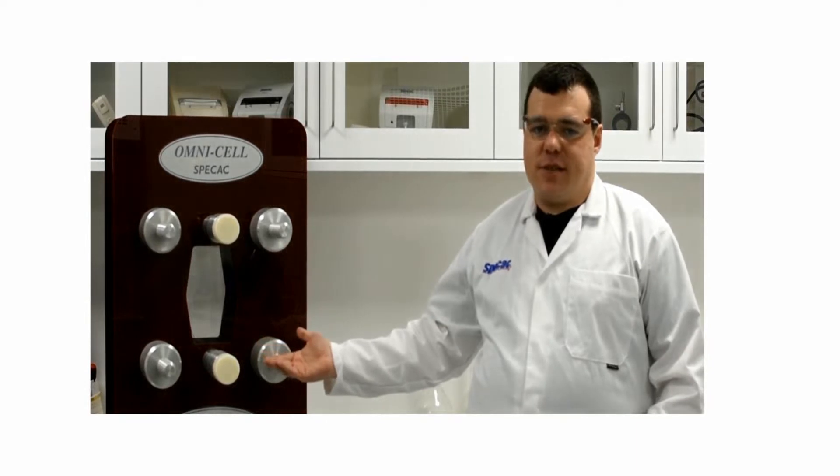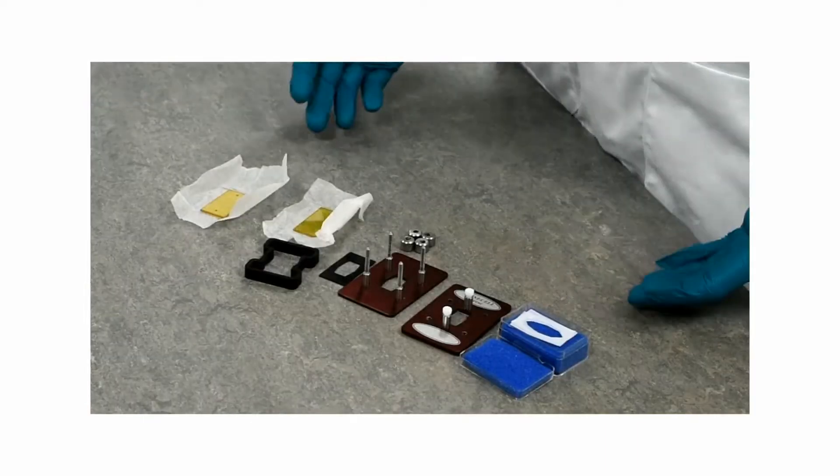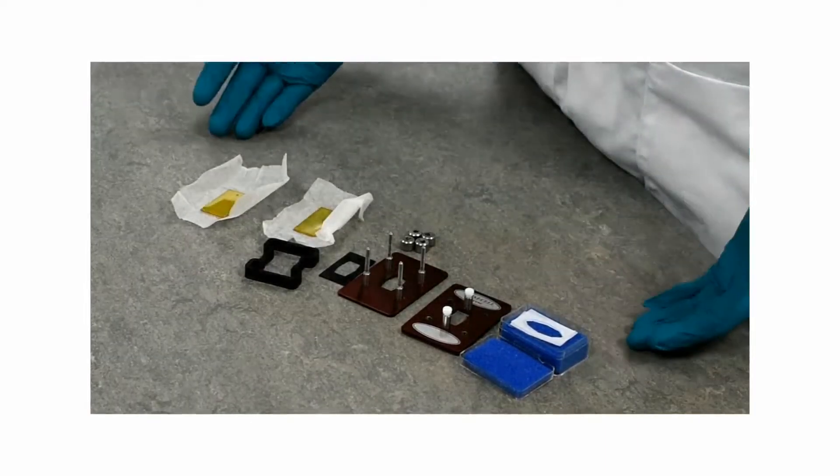Hello everyone, welcome to the demo lab. I'm Dr. Andrew Davis and today we're going to be learning how to assemble your omni-cell. When you receive your omni-cell you will have the following parts.